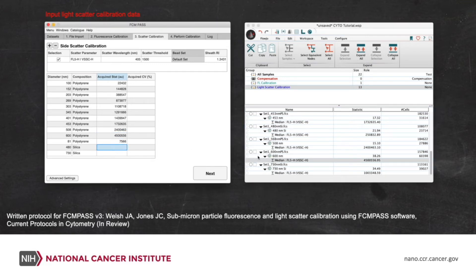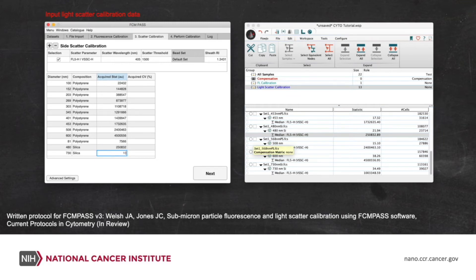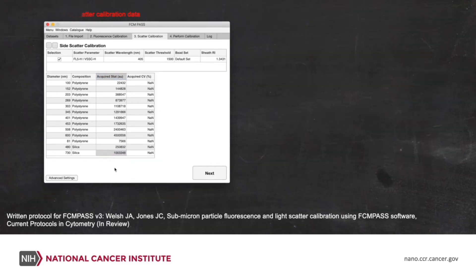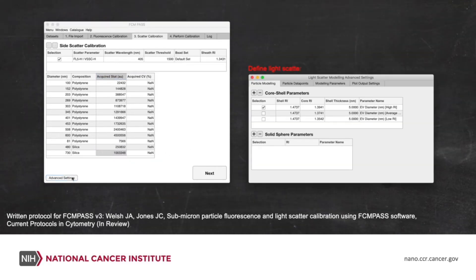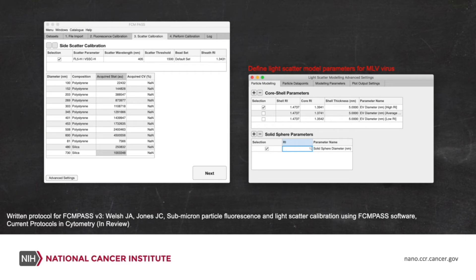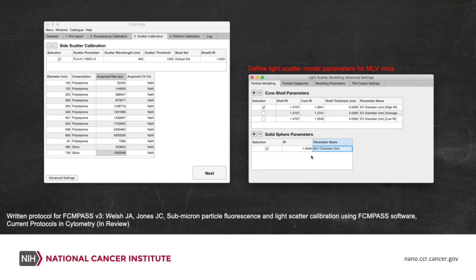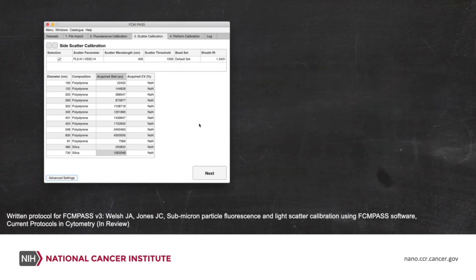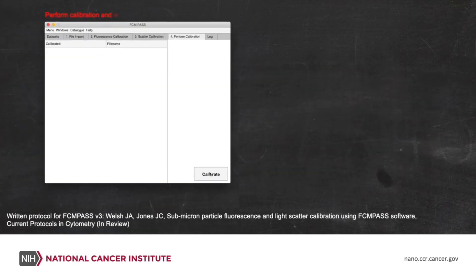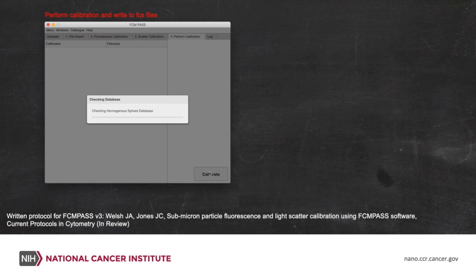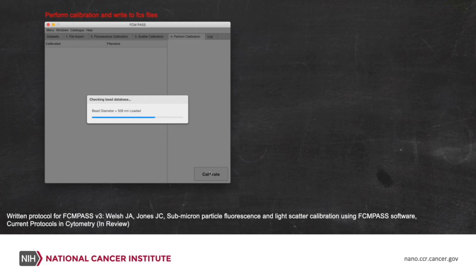By default in the software, if you were going to press calibrate now, it would automatically generate models for EVs with a low average and high refractive index, which you'll see in the table here on the right. What we need to do is add one more refractive index in to represent the virus. So this was put as 1.4546. And in the FCS file, we want this to appear as MLV diameter. So we'll just edit that in there. That will be added to the FCS file as well now. So that's all we need to do now for the calibration. And all we have to do is press calibrate. I've left this purposely in real time so you can get an impression of how quickly this can be done. And we've essentially gone from start to finish with this calibration now in less than 10 minutes.